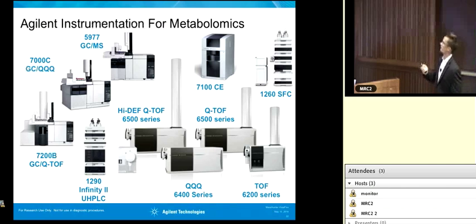There's a middle one here where, based off the color, we can monitor stable labeled isotope incorporation. So was there label flowing into this metabolite, or was there not? When we look at the pathway visually, we can quickly tell. And then we can do both and say there is a change in abundance and there was incorporation present. For this experiment, we are able to show that there is both incorporation and change in abundance in 2-HG.